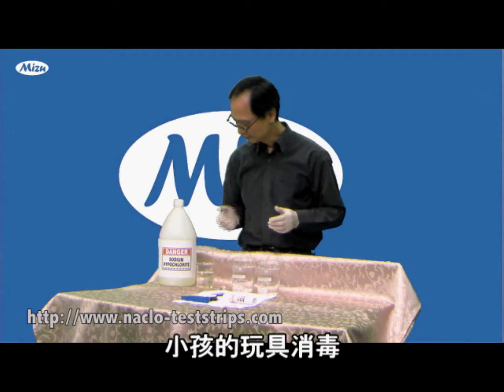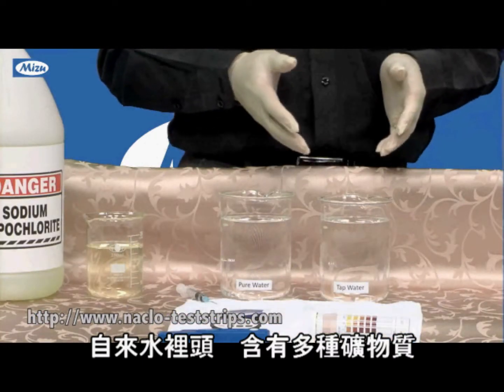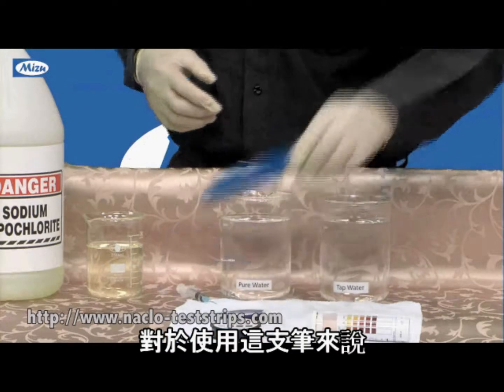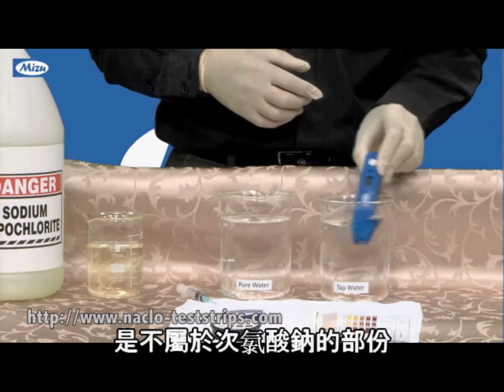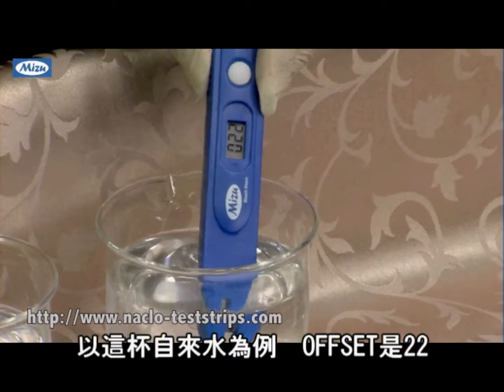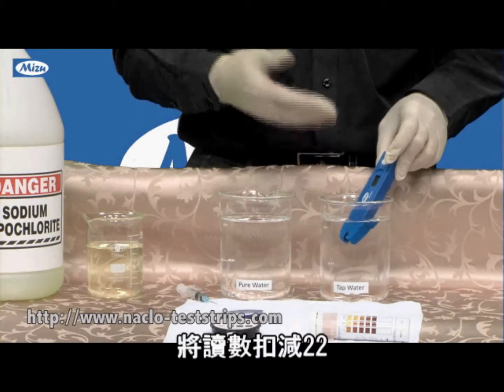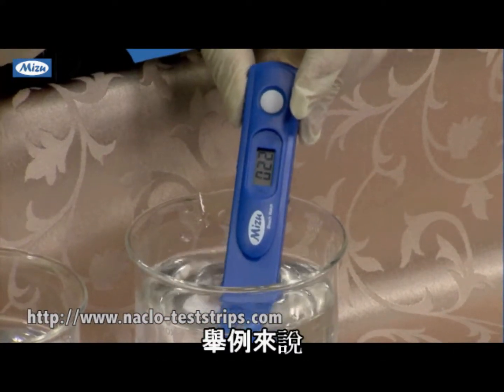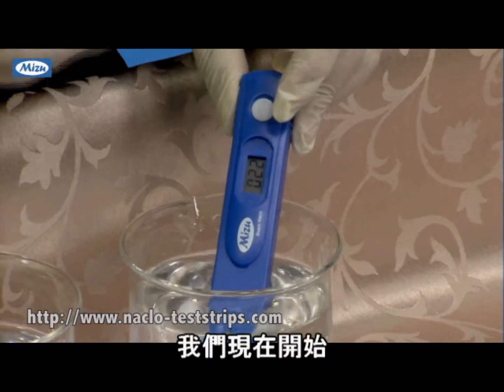But not all people use pure water to prepare solutions. 99% of the time, sodium hypochlorite solution is prepared with tap water. Tap water contains a lot of mineral material, inorganic compounds — so this water has an offset. For this tap water the offset is 22. This 22 is already in the water and will interfere with the reading. So when using tap water, we need to subtract this 22. For example, to prepare a 500 ppm solution, we should target 522 on this meter.